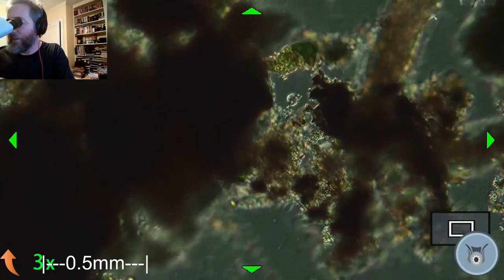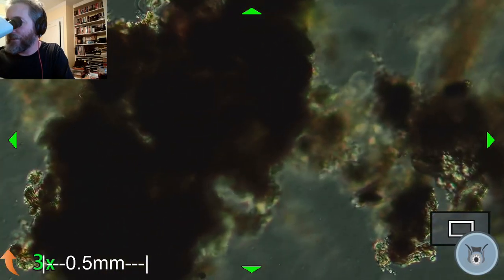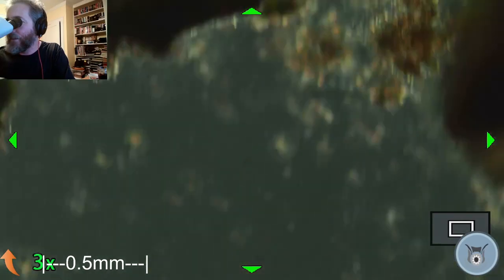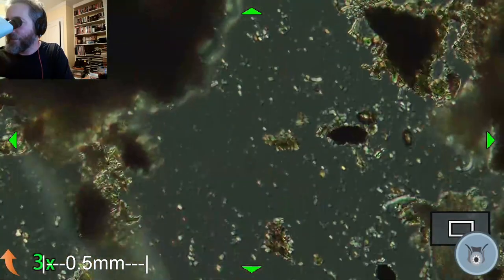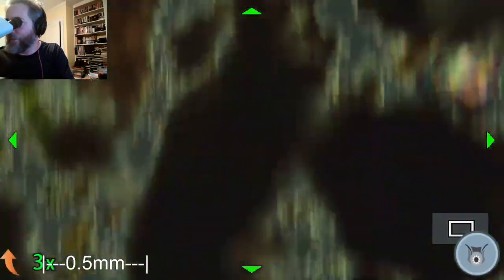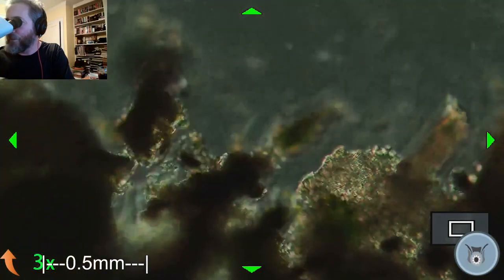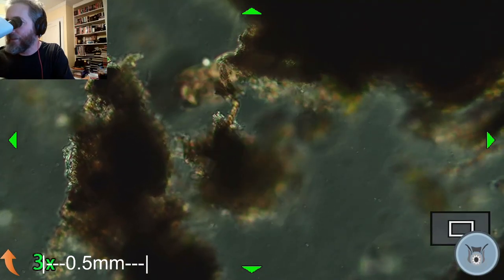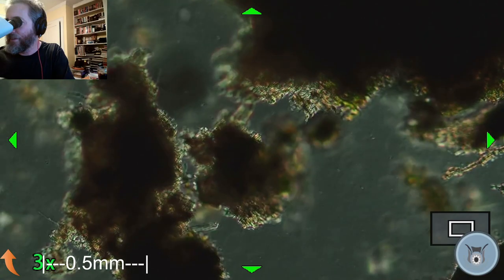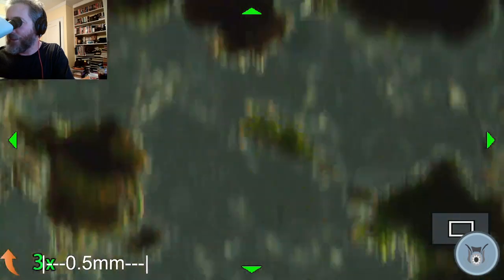I think that's another water bear. I think it's hiding on the other side of this pile of junk. Okay, well, I did want to see if I could get a little close-up of a rotifer again so we could get another look at them. See if I can find one for us. I just saw a ciliate go sliding into this. That's a rotifer, but it's mostly behind stuff. I want to find one that's kind of out in the open a little.